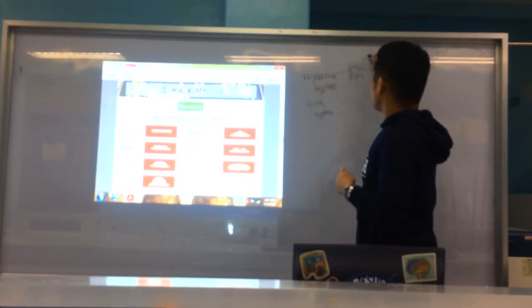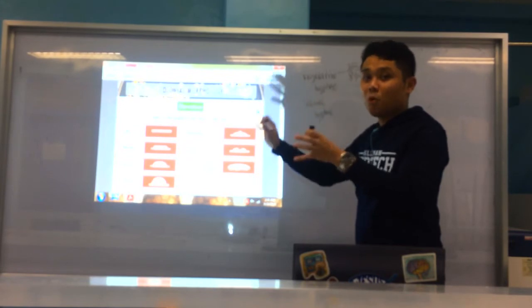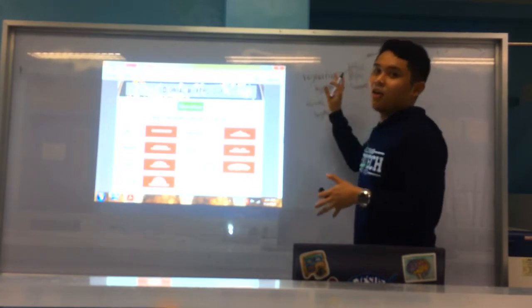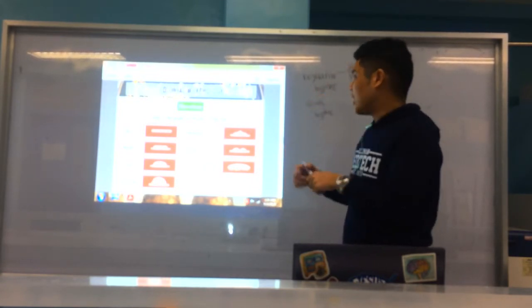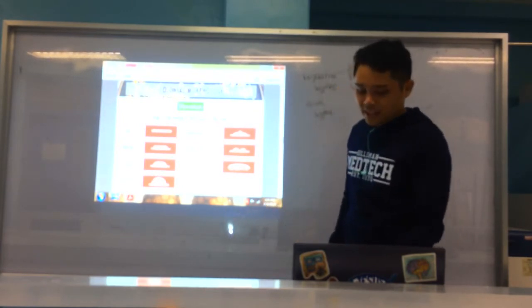So your aerial hyphae, basically ginagamit na siya for reproduction, dira sila magpagawas og spores. Ang vegetative, by the name itself vegetative, sila ang mo supplement og nutrients. Okay? So sila nang mo kut-kut sa culture media. Okay? Alright, so mycology na ni. Okay. Alright, so that's again for elevation.